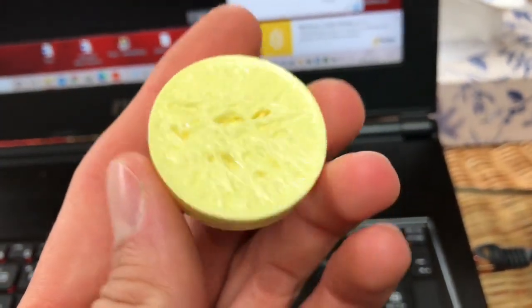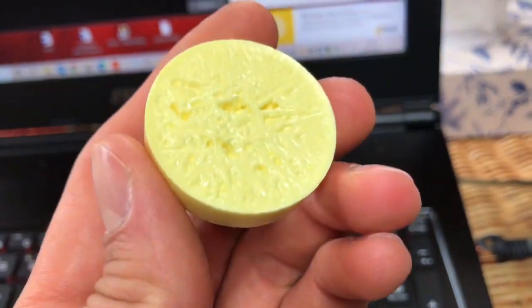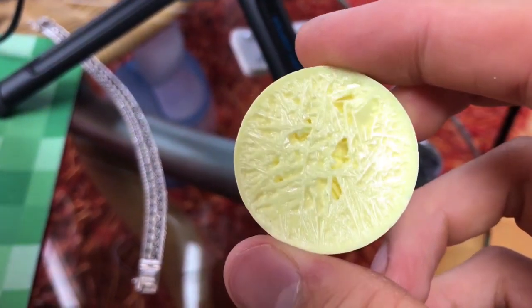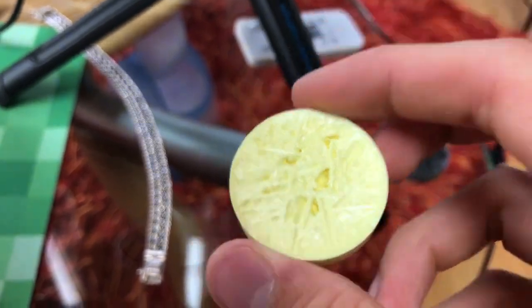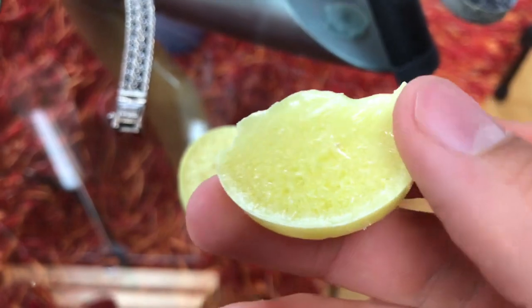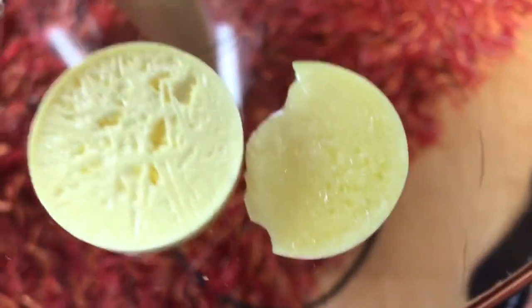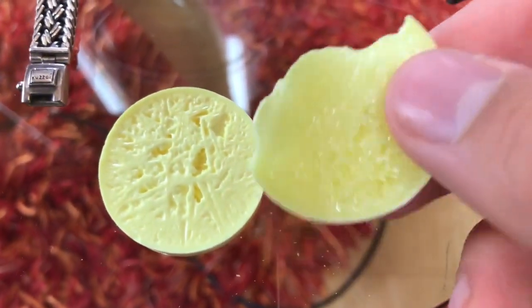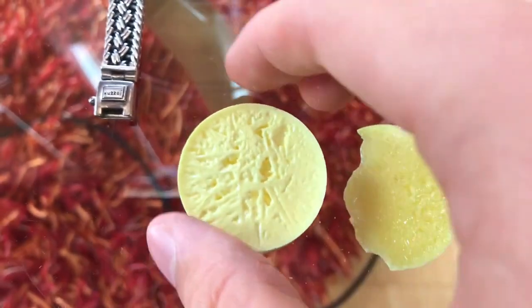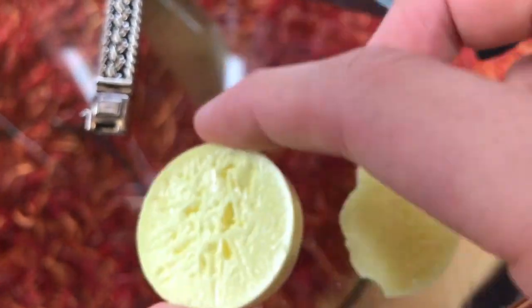Afterwards, the sulfur disc looked like this. It may still look the same to you even after the time lapse, which didn't turn out to be that good, but when compared to a freshly prepared disc of the sulfur, you can clearly see the difference. This one is much clearer than this one, which seems to be almost white.